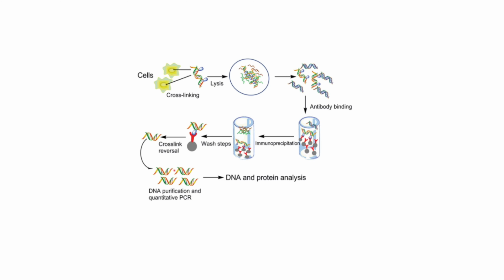Based on that, we collect these reads and align them to the reference genome, so we can know where these reads are aligned. Because of that, it can help answer the question of how a gene is regulated.